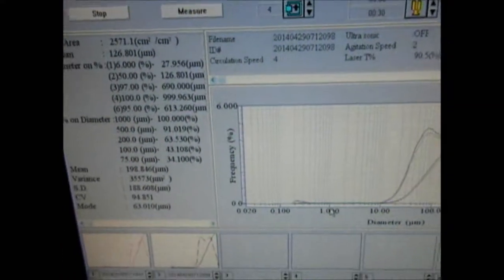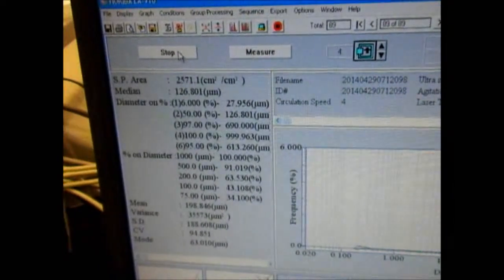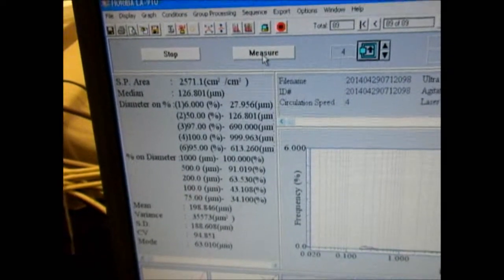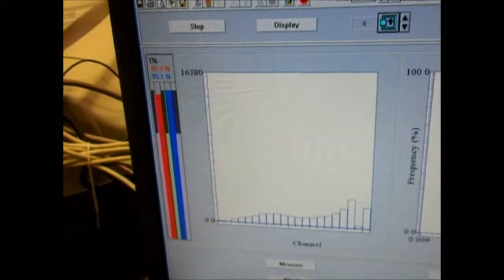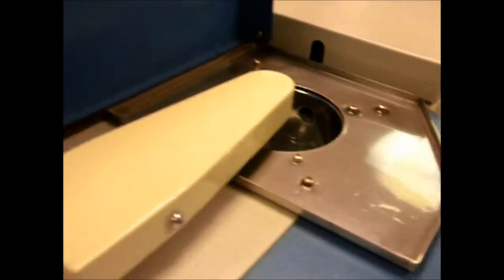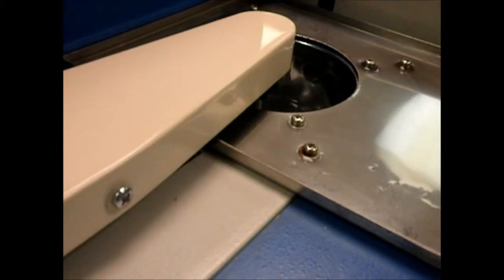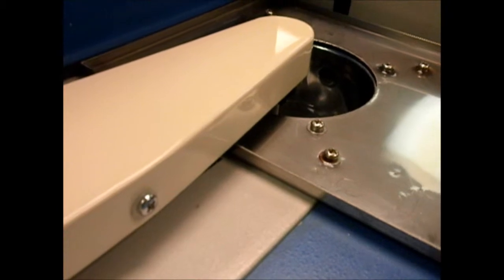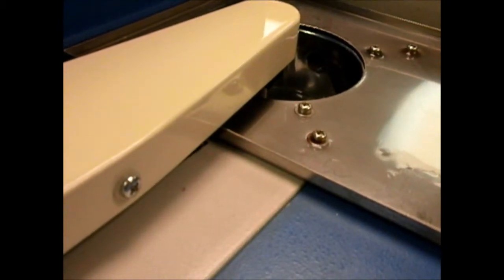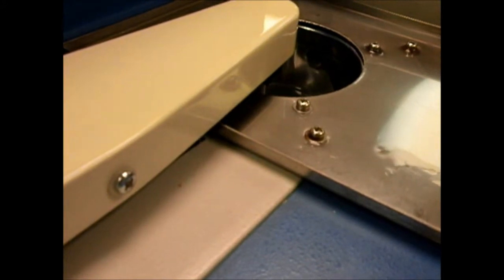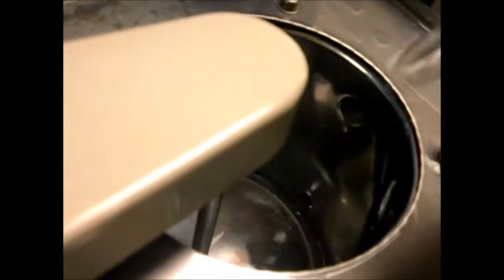I'm happy with what I see, so I'm going to stop the measurement by bringing the cursor to the Stop button. Then I'm going to move the cursor to Measure and drain the liquid. When draining the liquid from the circulation bath, I want to pour some fresh IPA into the cup as it drains to help flush it through — just a little bit to get it to mix through; you don't need to pour the whole thing.